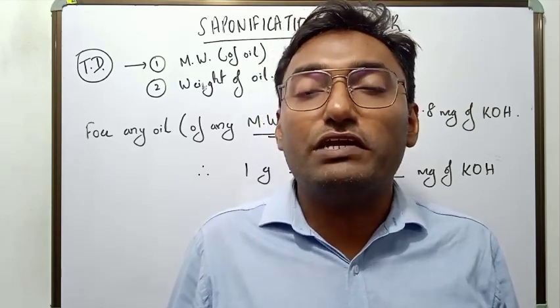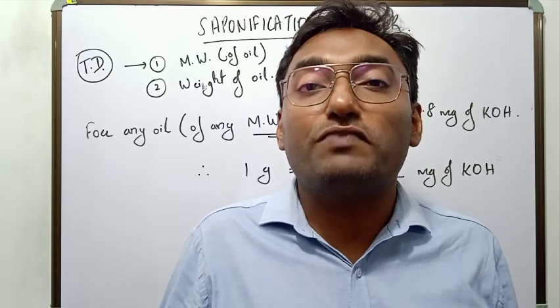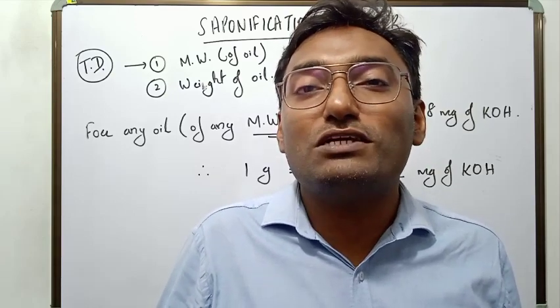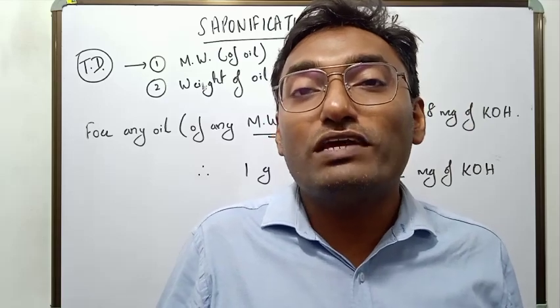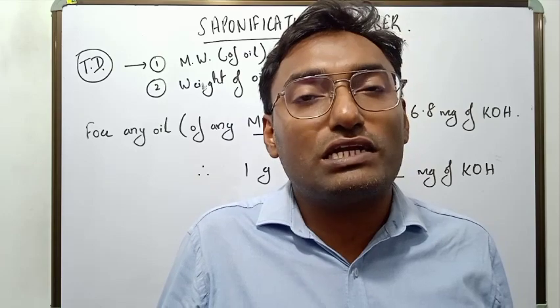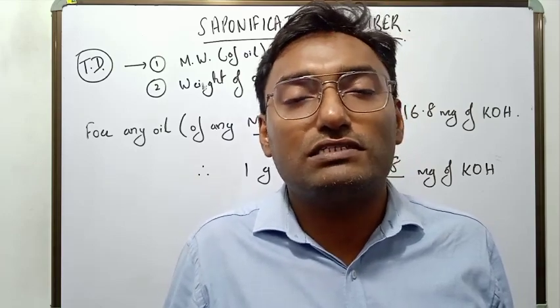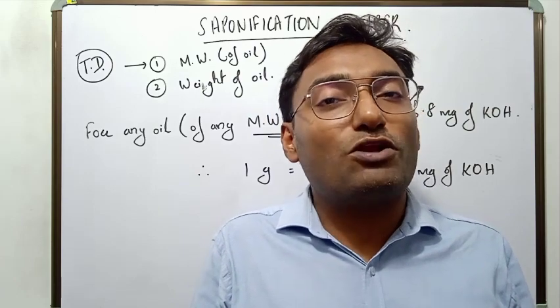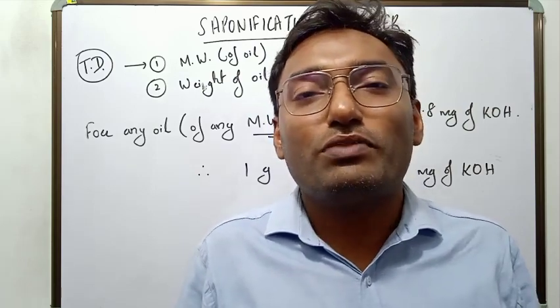In the first part of the video, we have seen what is saponification, what is a soap molecule, the origin of the soap molecule, how we can make a soap molecule, and we have also seen the cleansing mechanism and theoretical determination as well as significance. In this part, we will stress upon the practical determination of saponification value.